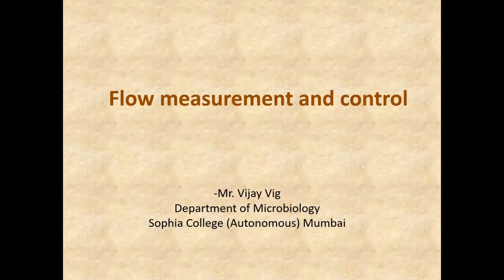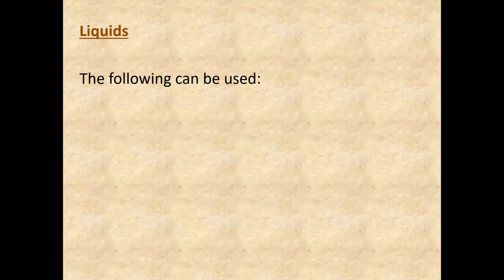Hi everyone, in this video, we will study measurement of flow rate of liquids in a fermentation. How would you monitor the flow rate of liquids during a fermentation? Now, the flow rate of non-sterile liquids can be monitored by a number of techniques, but measurement of flow rates of sterile liquids presents special problems which have to be overcome.